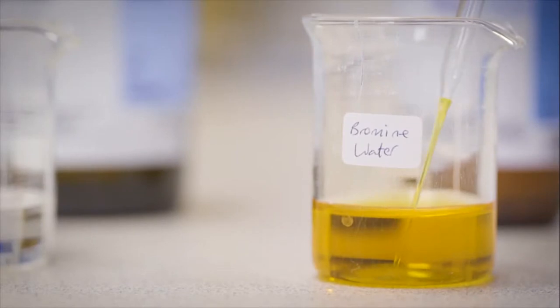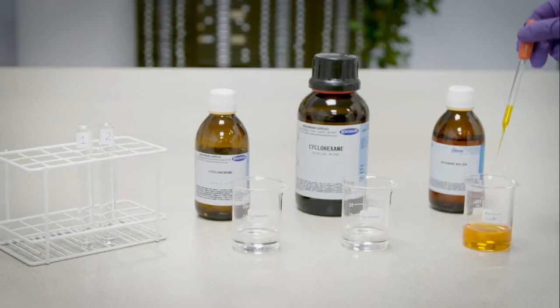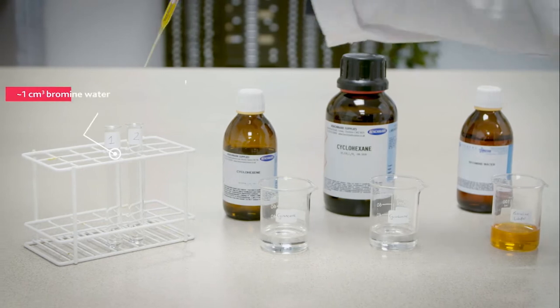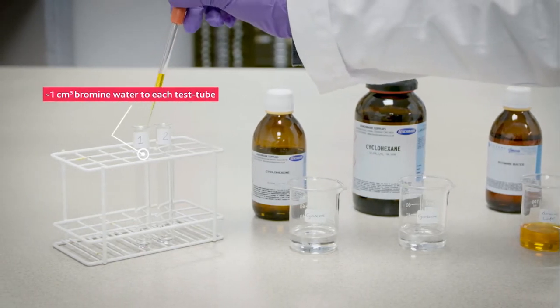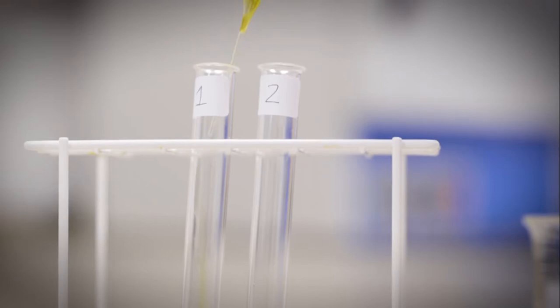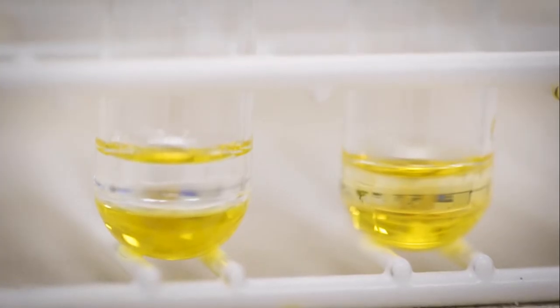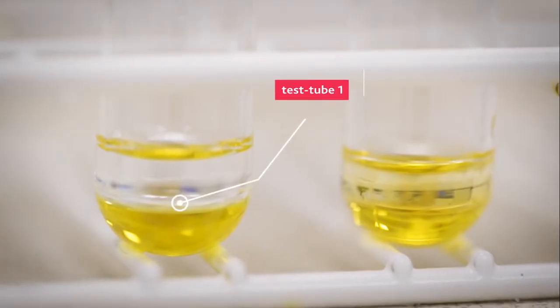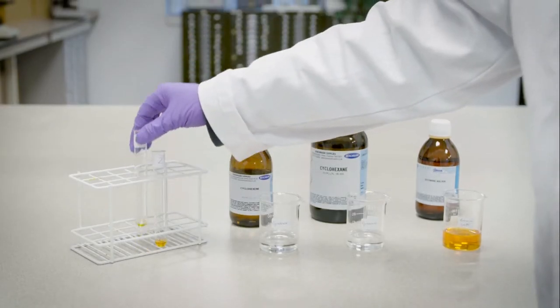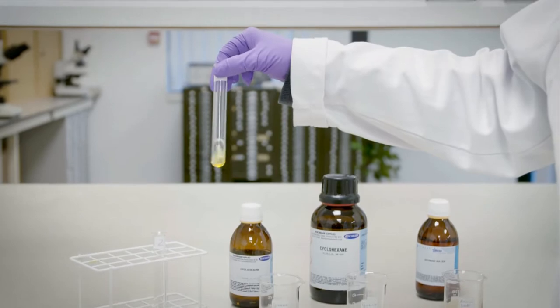Then, bromine water is added to each test tube. At first, nothing appears to happen in test tube 1 containing cyclohexane. As the reaction can only happen at the boundary between the two phases, the mixture is shaken.